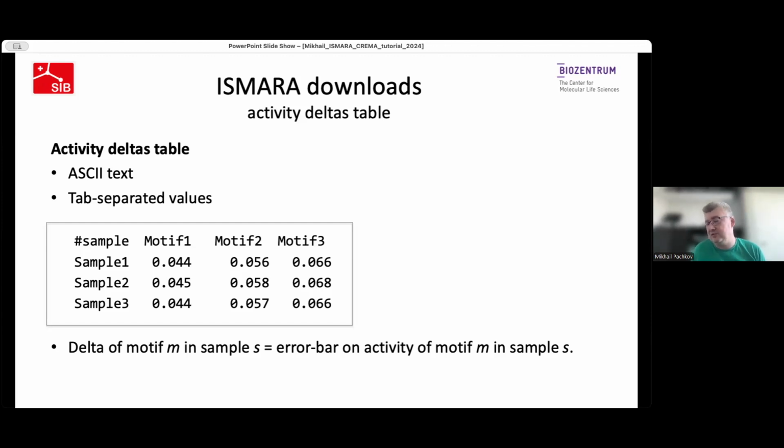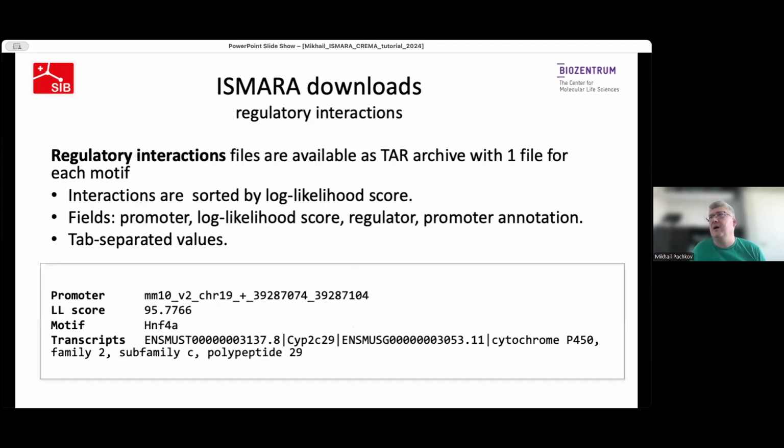So you can do it also yourself and, for example, play with the order of samples or make some changes and so on.